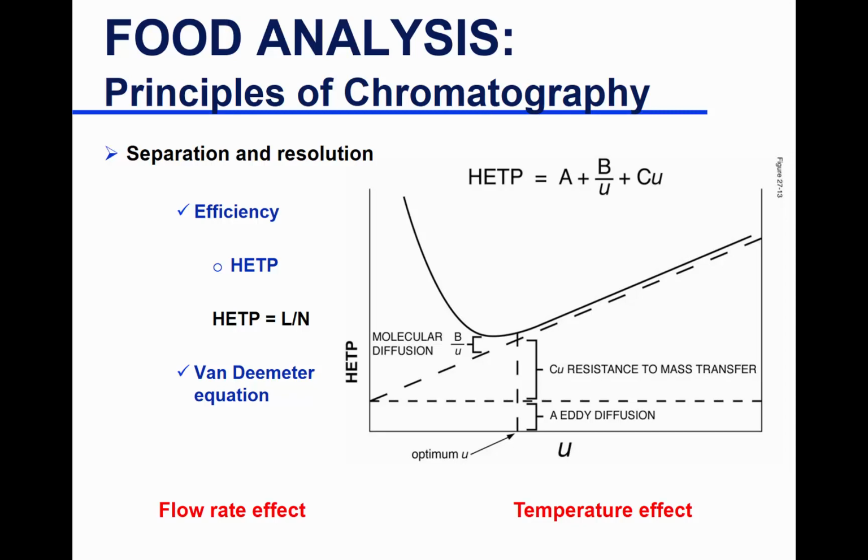So here is to illustrate that the packing, or your stationary phase particle size, has a huge impact on resolution. So the smaller the particle size, the better the resolution. Okay? The more packed they are, the less void there is between the particles, the better the resolution.